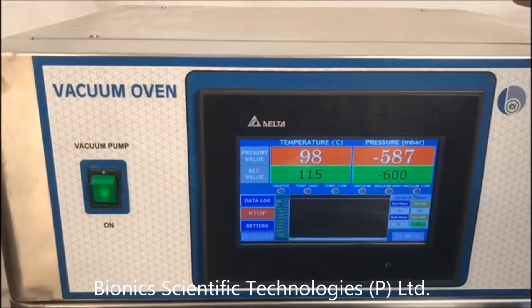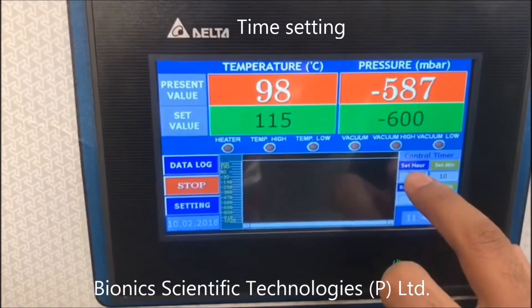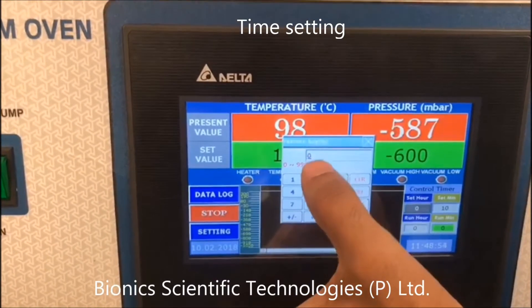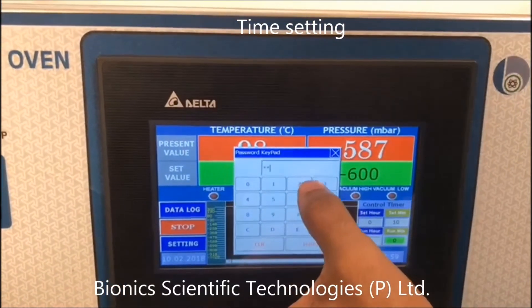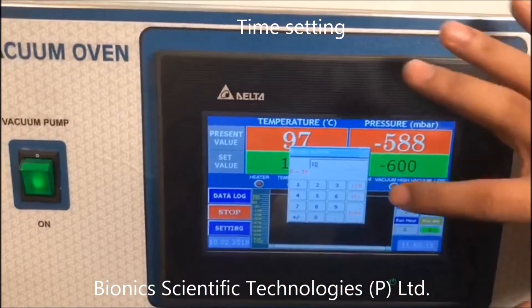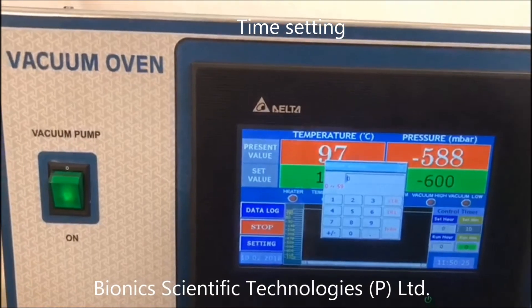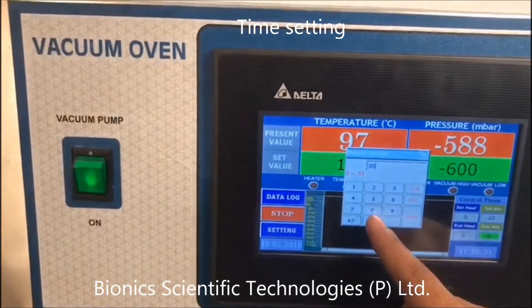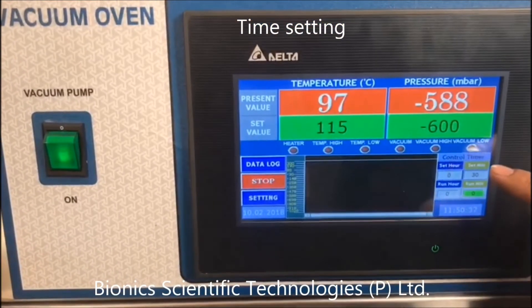For the time in which you need your temperature to be reached, it is written here: set hours and set minutes. I have already set zero hours over here. Press enter, and for the minutes — I delete it first. Let's say I need 30 minutes. Press enter. So there is zero hours and set minute 30 minutes.